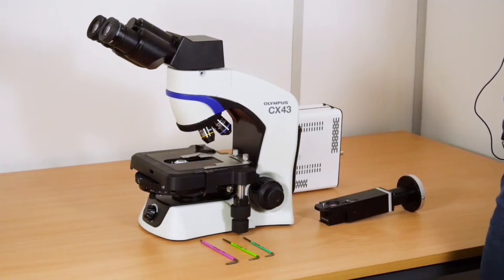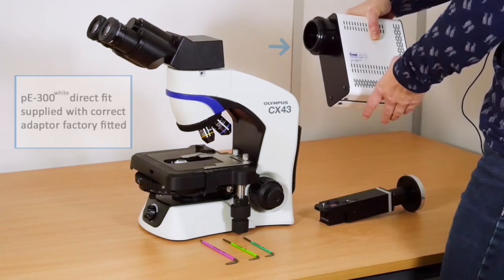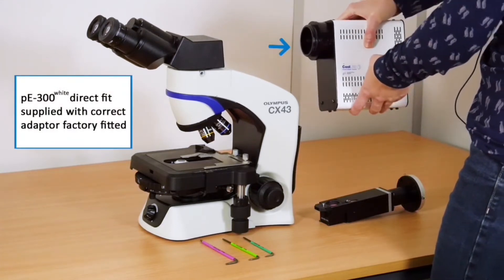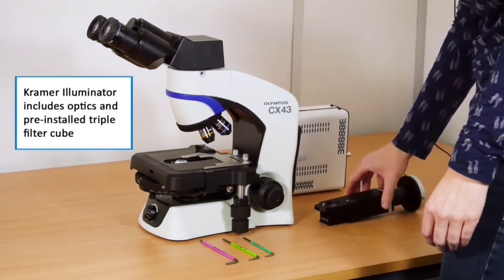Today I'm going to be showing you how to add a fluorescence light source, our CoolLED pE-300white, to the Olympus CX43 microscope via the Kramer adapter.